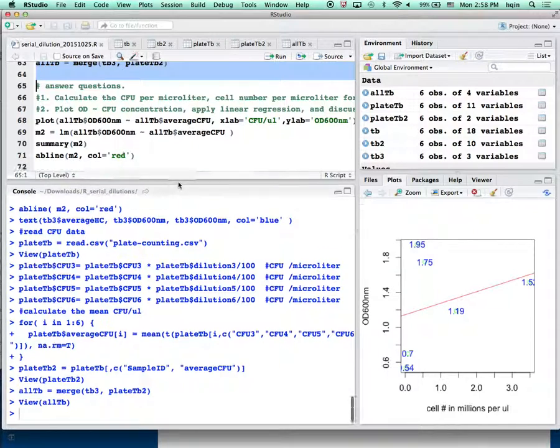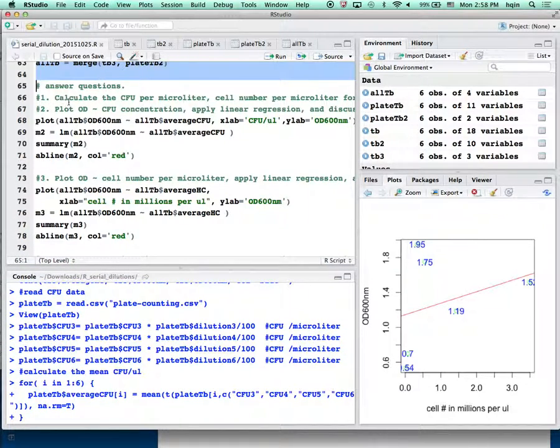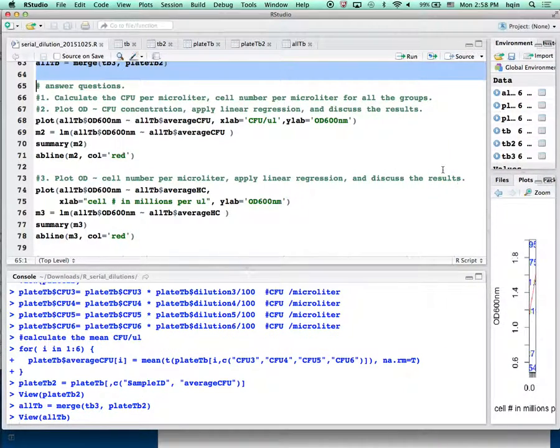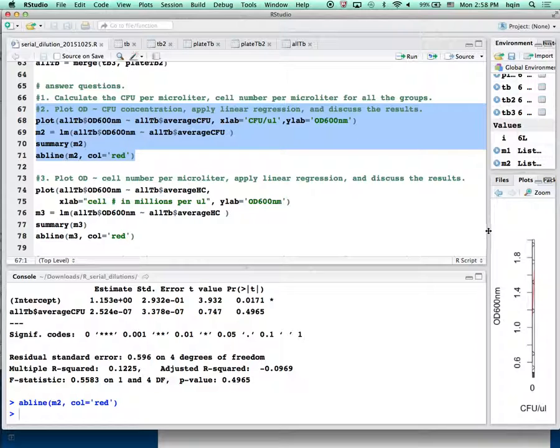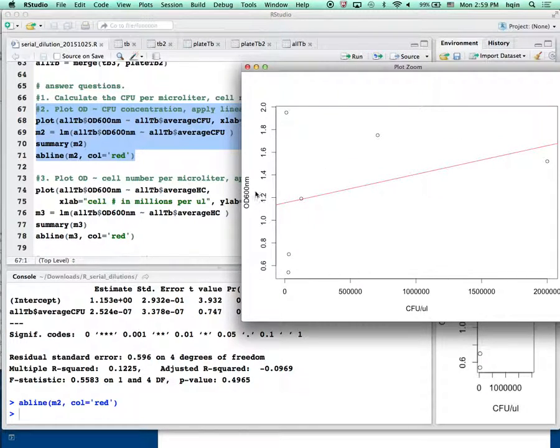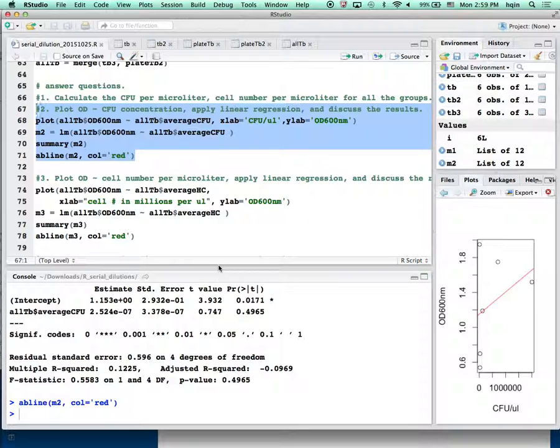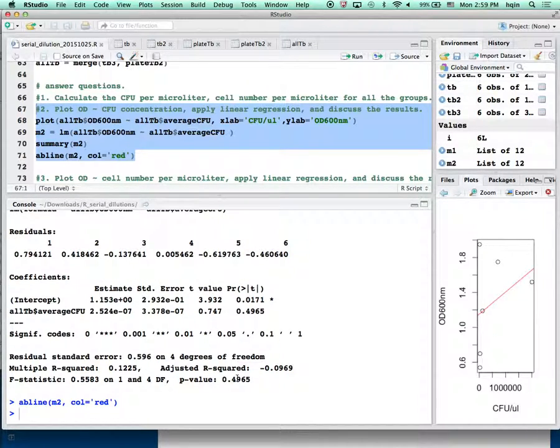These are the questions I ask you to answer for the lab report. The first one: calculate CFU per microliter — we already did that. The second one: plot optical density versus CFU, apply linear regression, and then discuss the result. Running that now — the x-axis is optical density, the y-axis is CFU. Linear regression at the bottom shows P-value is 0.49 and R-squared is 0.12, so this is also not linear at all. You write your report and try to discuss possible reasons why that's not the case.